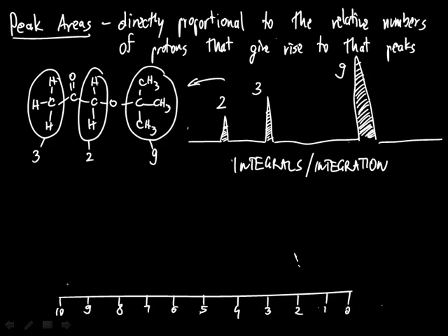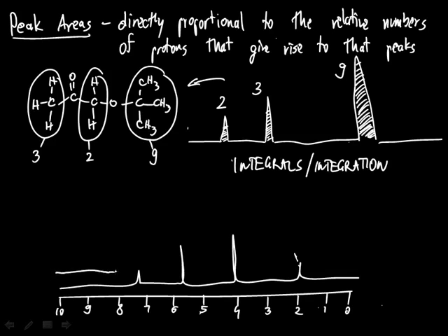What I mean by this is that if we have an experimental NMR spectrum where we have several peaks, we will then have typically a thinner line which will be flat until it hits the first peak, and we'll have a little jump. It'll be flat again, and we'll have a larger jump here, and even larger jump here, and again a small jump here.